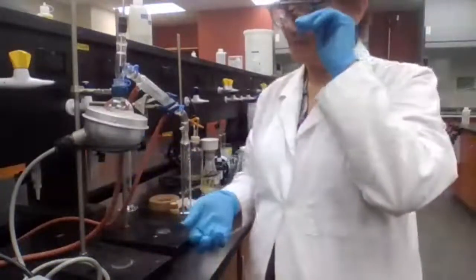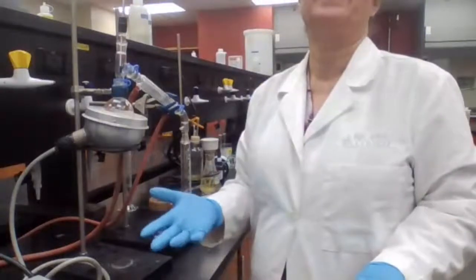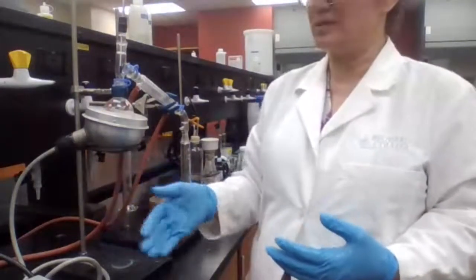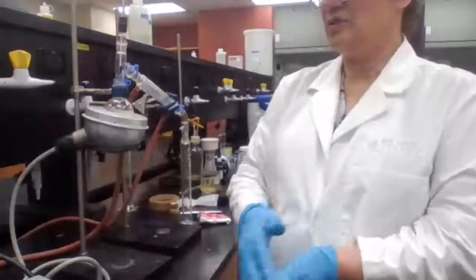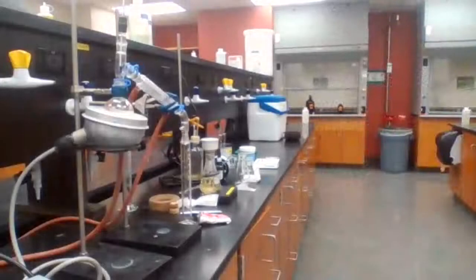What number should I put? Is there a fixed number? It could be a fixed number or it could be just a general answer. So tell me what I should set. What are the factors for the setting? What do you think? While I'm connecting the water.